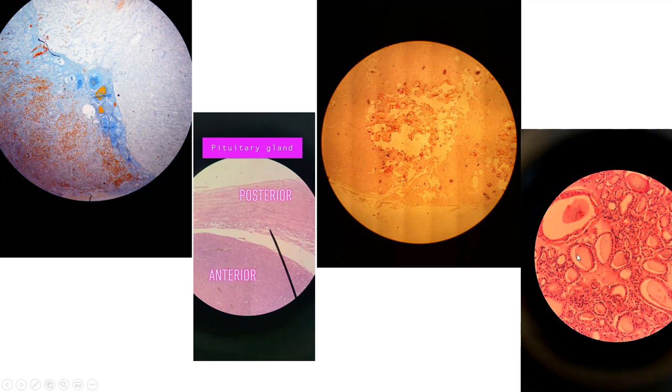Here's a microscope slide of the thyroid gland, and there's a few things to discuss here. These circles, like you see here, here's a big one here, and here, these are the follicles, and they're made up of these cells called follicular cells. The cells in between the follicles, remember, are called parafollicular cells, and they release a different hormone. But the follicular cells are the ones that secrete the T3 and T4. And the stuff that they're secreting that's in the middle of it, that's called colloid.